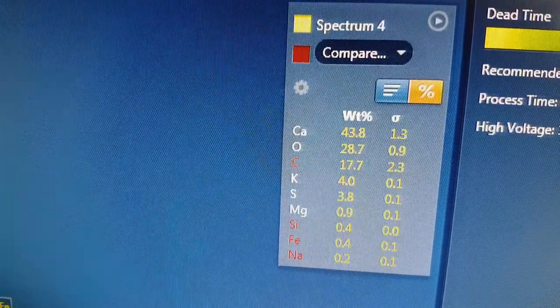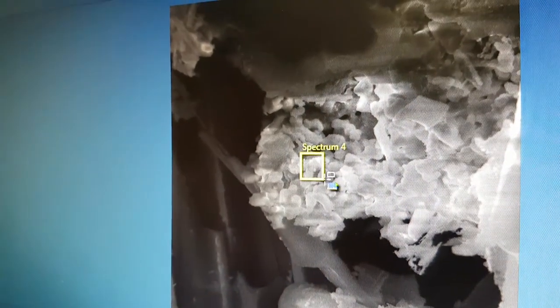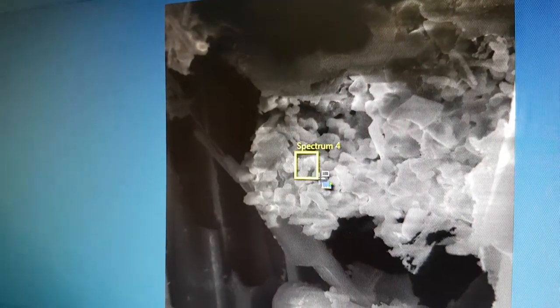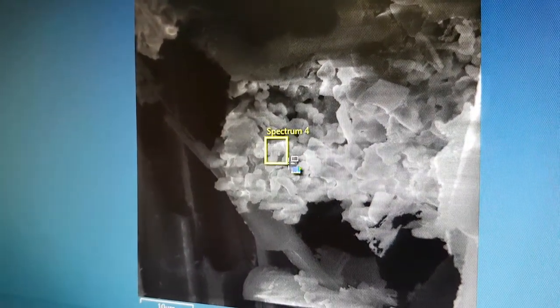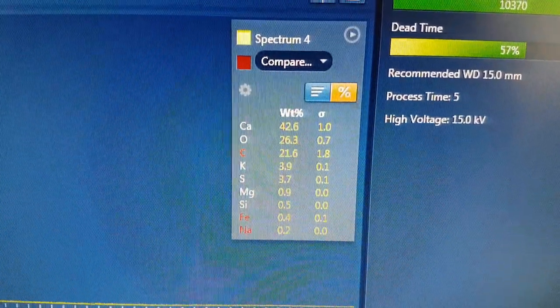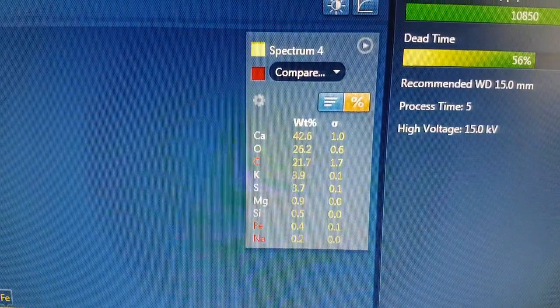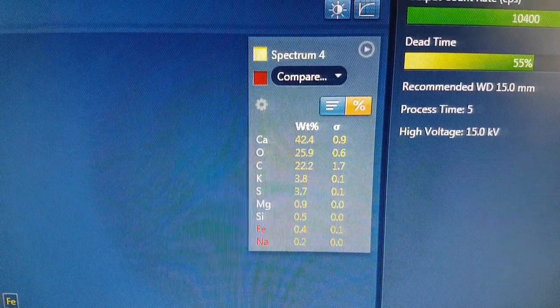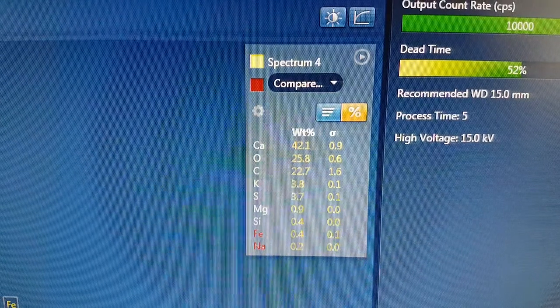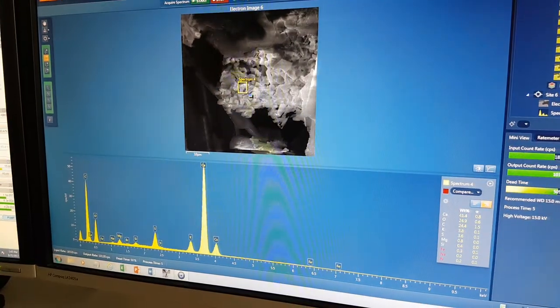It's not surprising, it's just this extremely large amount of calcium, isn't it? But again, you're essentially seeing George Joshua products but a very, very strong peak for calcium.